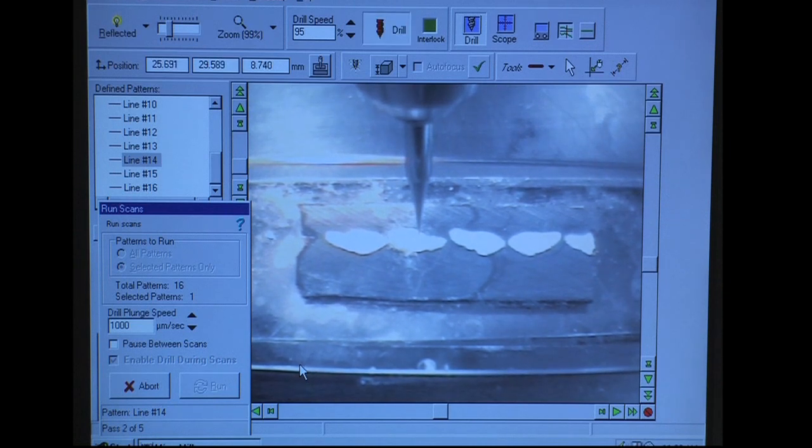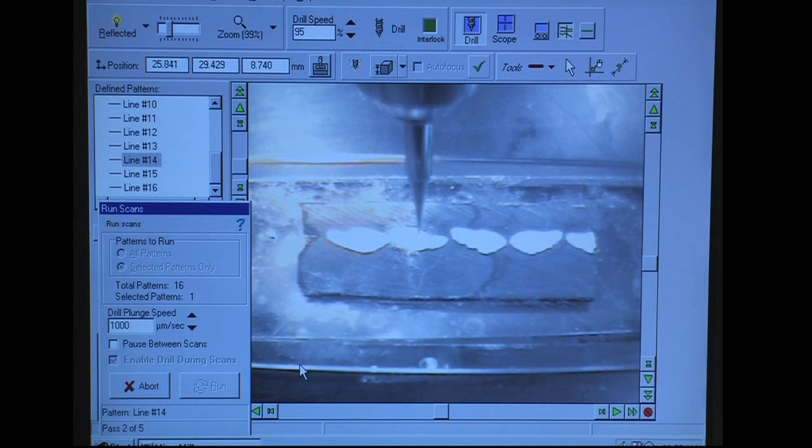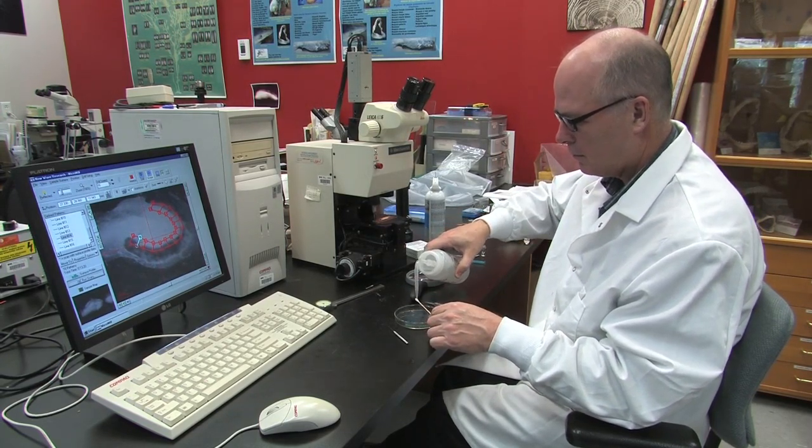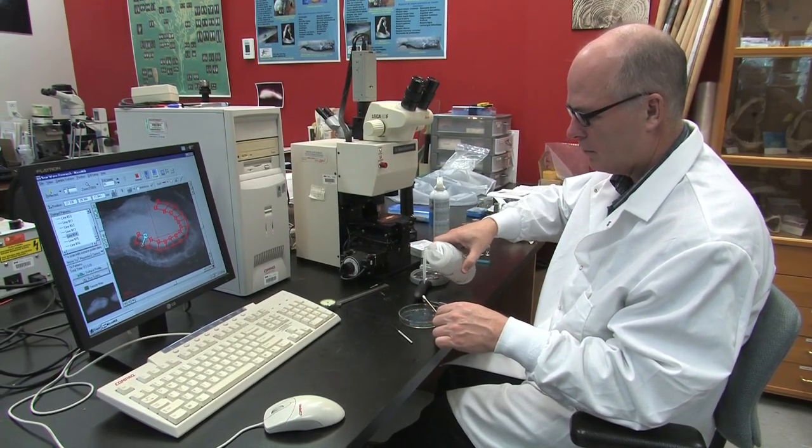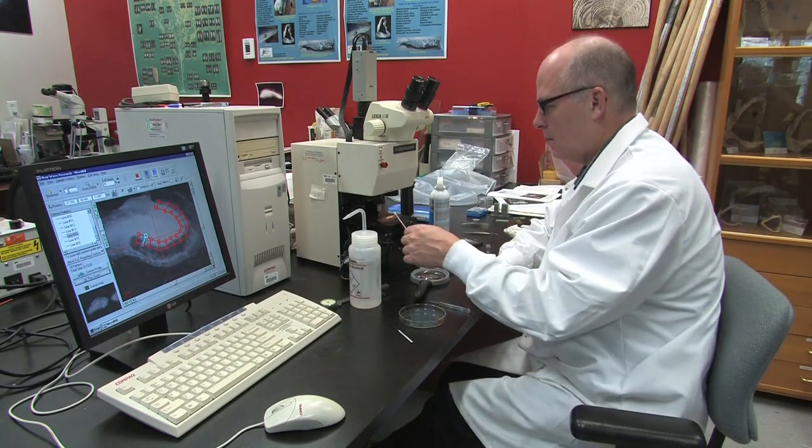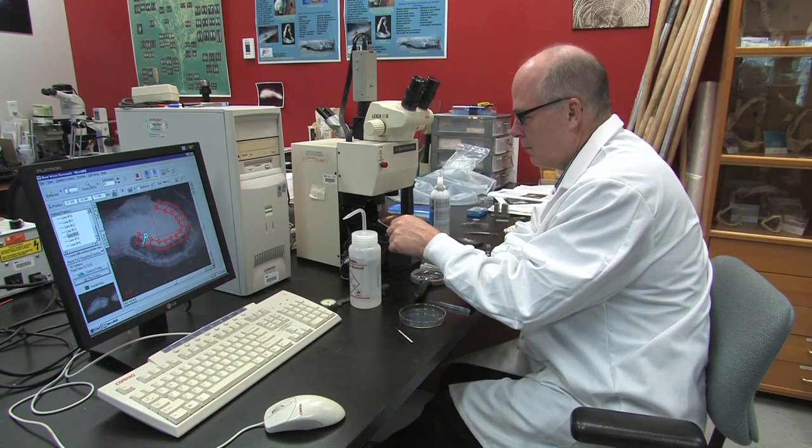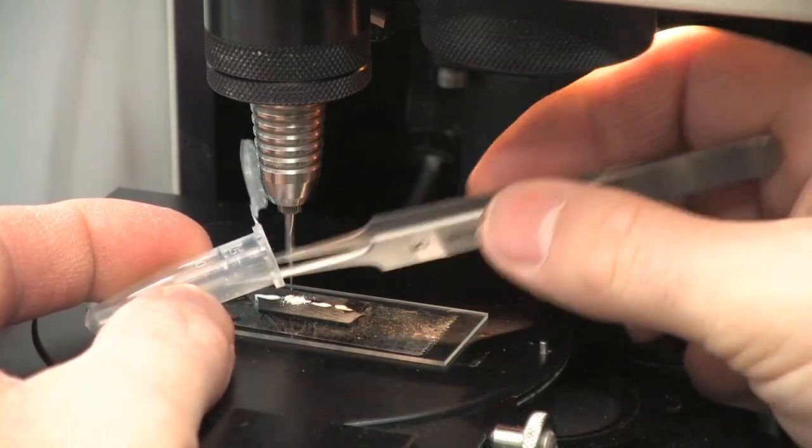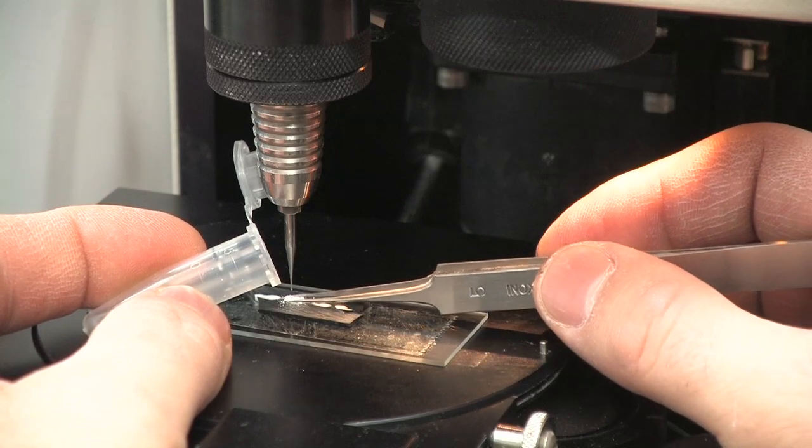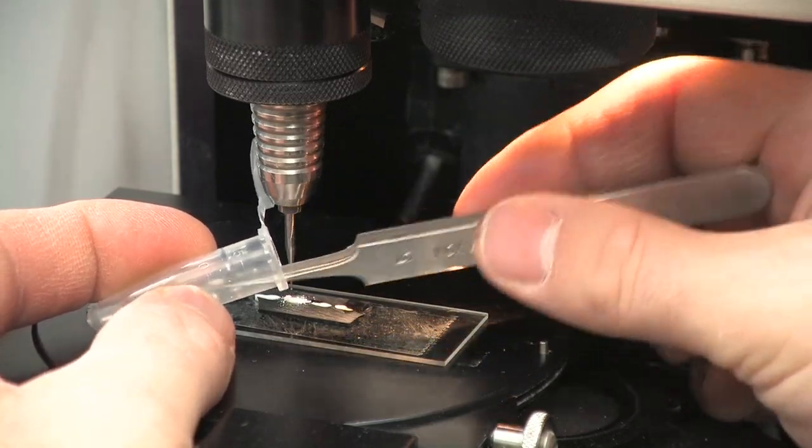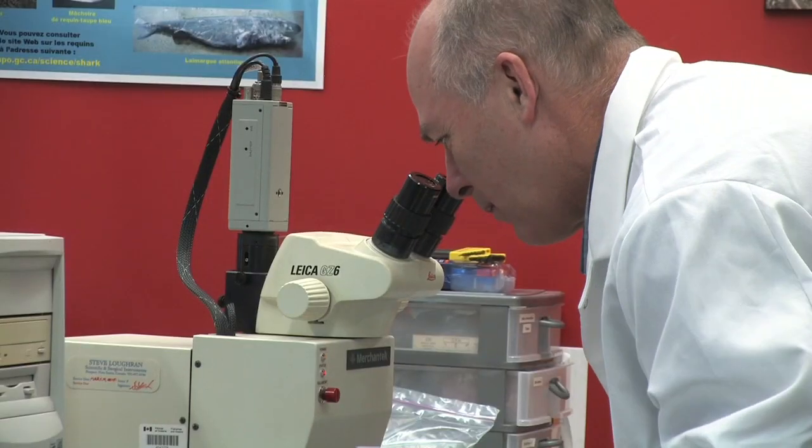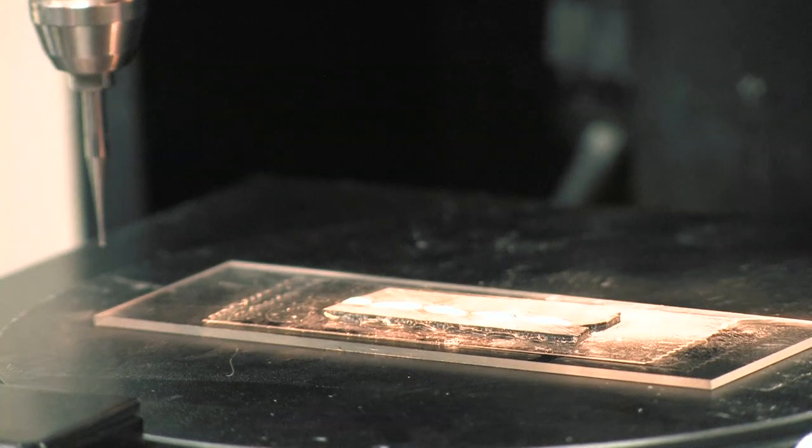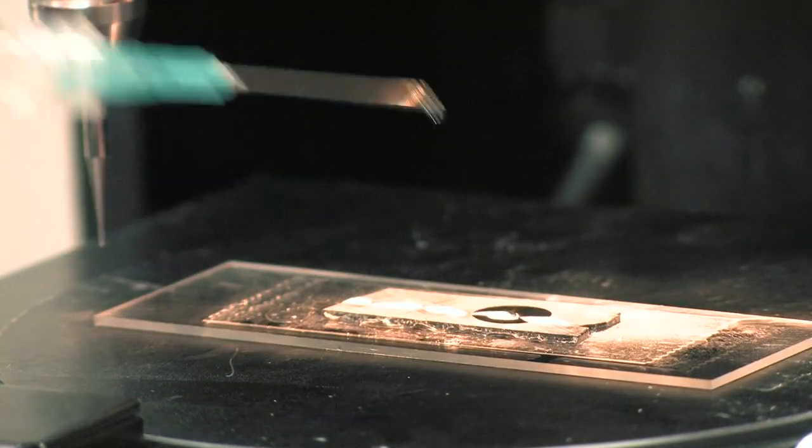Once the area is drilled, you can transfer the powder to an acid wash vial. Make sure all tools you use are cleaned in ethanol when taking samples for isotopic analysis. The powder is too fine to apply the decontamination procedures seen in the otolith decontamination video. Transfer the powder with a pair of forceps and a small probe. Place the powder into the vial in a similar manner as you would under the dissecting scope. Use the micromill scope or the computer screen image to make sure you remove all the powder and clean the otolith sample well with compressed air and ethanol before beginning your next scan.